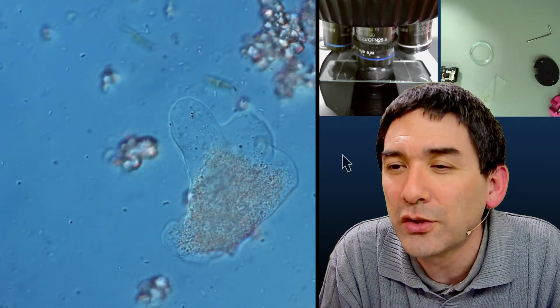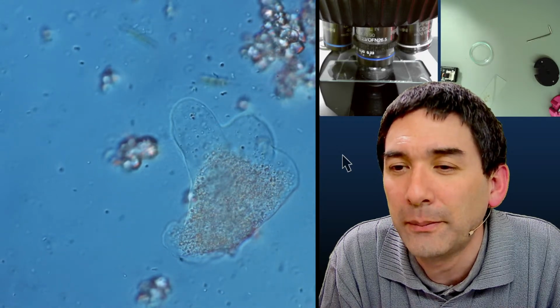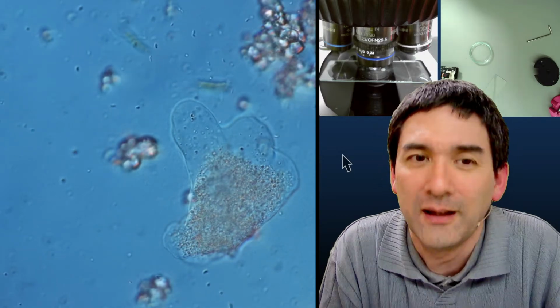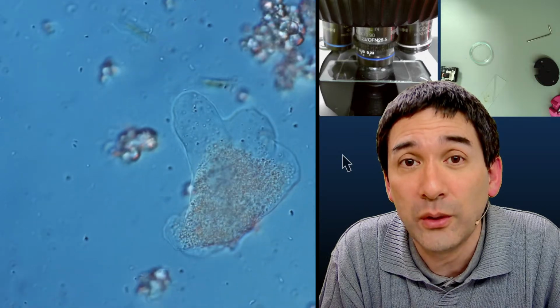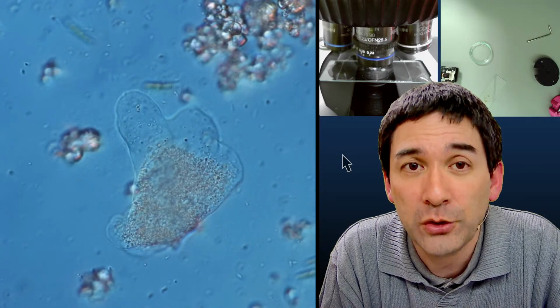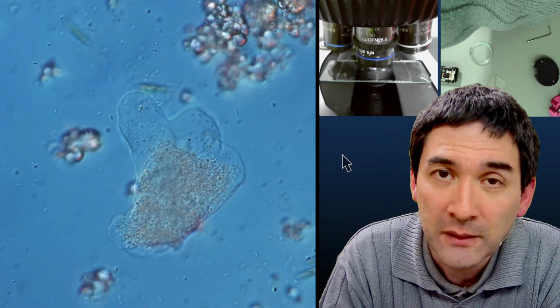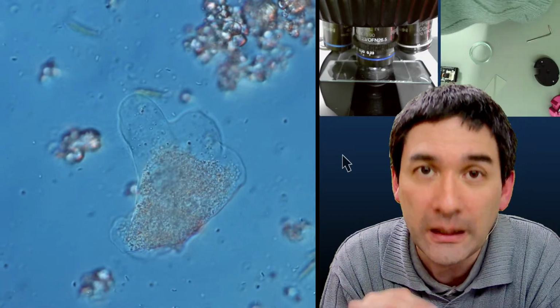I get at least 2 meters of snow every year and live right beside a field. What you can do is the following. If it's snowing, you can put snow under the microscope, but not the actual snowflake. Take a microscope slide and cover it with ice cold clear nail polish.